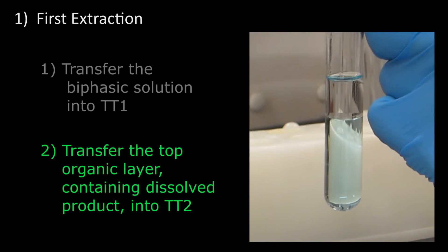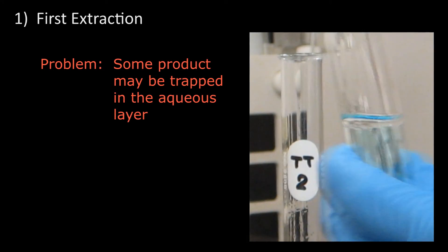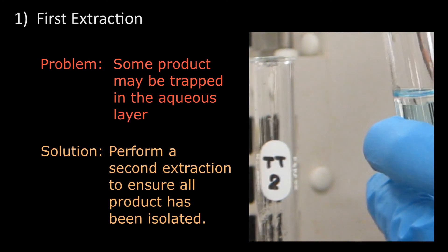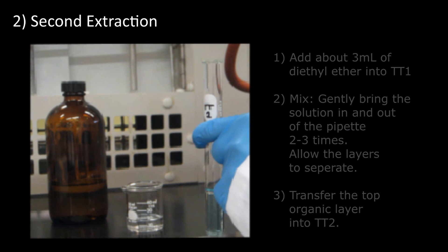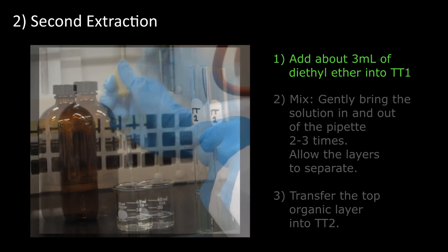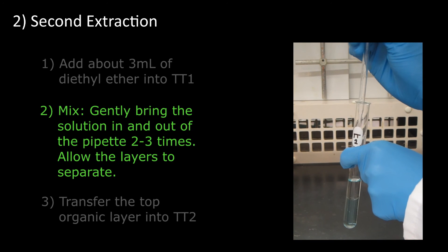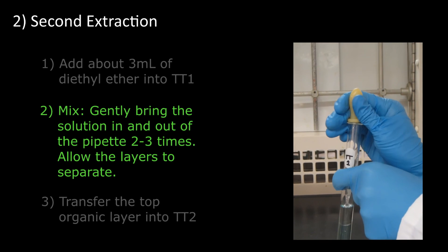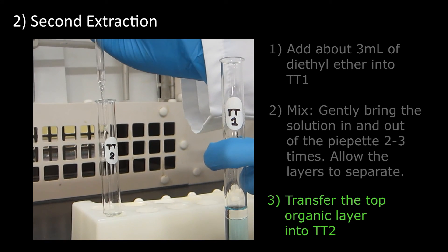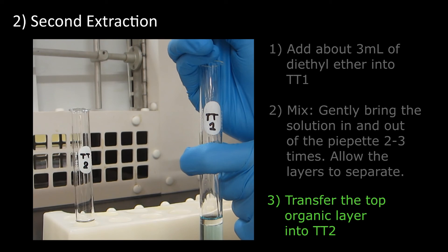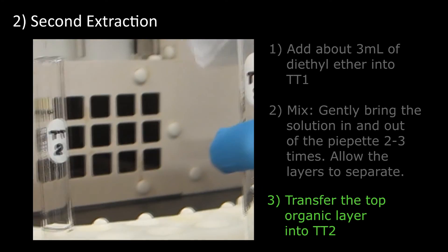Make sure not to draw any solution into the bulb of the pipette. This completes the first extraction of the original solution, but there may be more product trapped in the aqueous layer, so another extraction or two must be performed to ensure that all of the product has been isolated. To perform a second extraction, add about 3 ml of diethyl ether into TT1, which contains the water layer. Mix the biphasic solution by gently bringing the solution in and out of the pipette two to three times. Allow the layers to separate, and transfer the top organic layer containing the dissolved product into TT2, which already contains some product in ether solution.